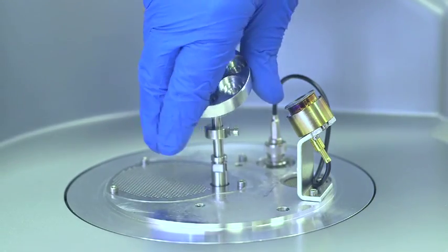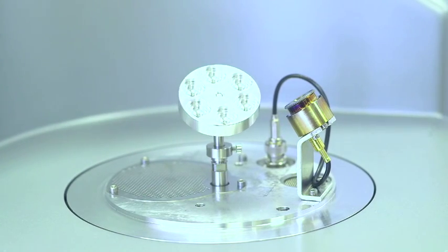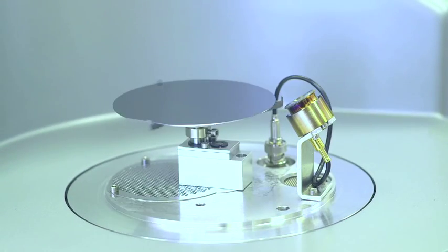These include the 6 place-tilting stub stage, 4-inch wafer stage and the roto-coater stage with rotary planetary motion.